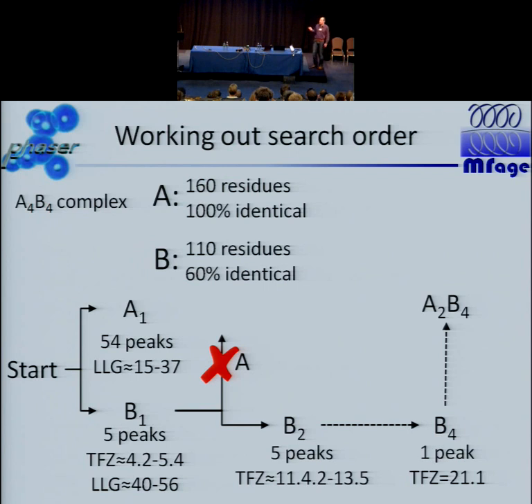And what's the reason for this? And that is in the B factors. So, these B factors you see are relative to the Wilson B, but it looks like the Bs have very low B factors, but the A components have something very high. And that's why, although we are expecting A to be a better model, it's in fact worse.